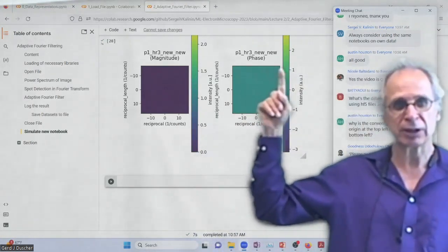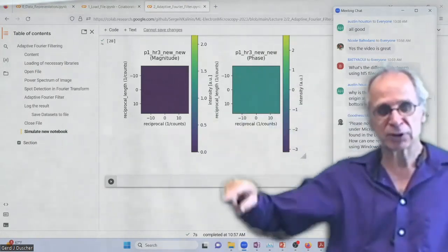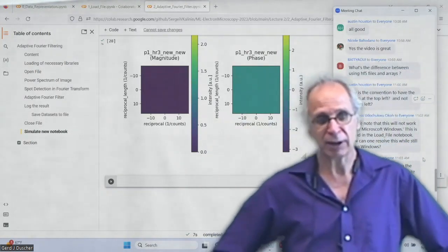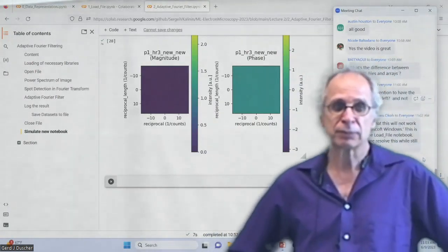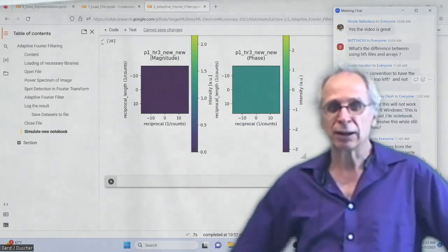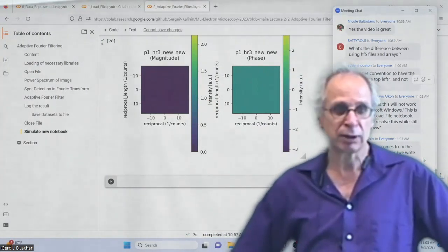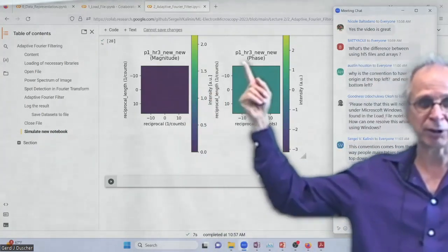The convention comes, I think, so here it's the same thing, right? So we start here. I think it comes from writing. The first SEMs, so SEMs were the first scanning microscopes, we start on the top left, and I think it comes from reading and writing. If it had been invented in Israel, we probably would go from here to here, or in an Arabic country.